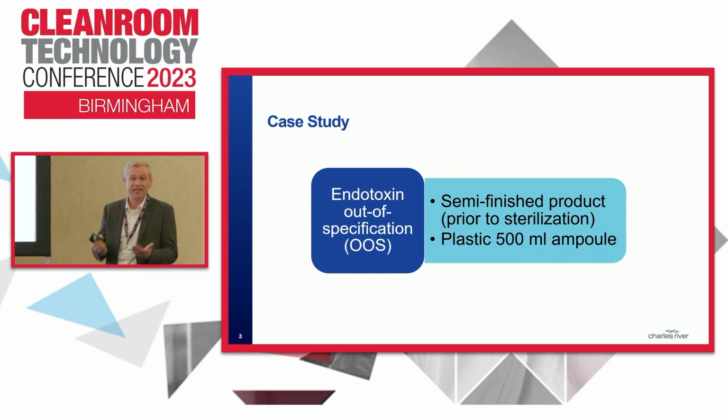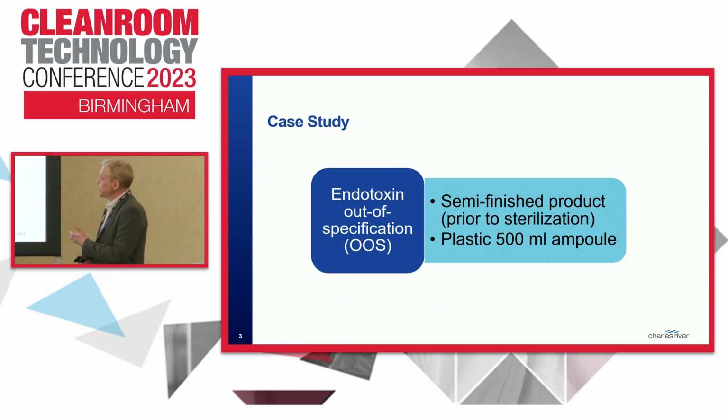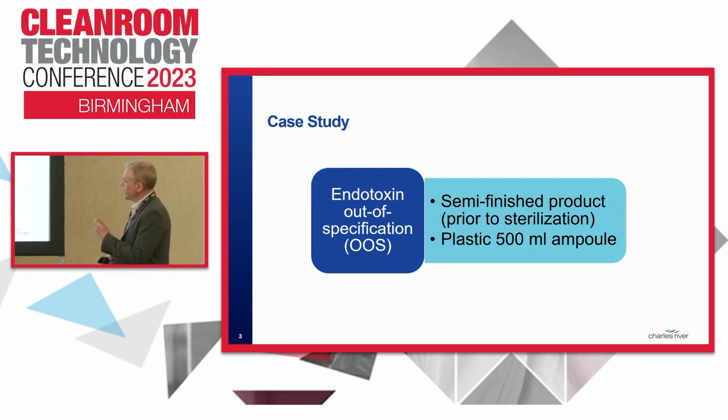If it remains in the product and ends up in the patient, it can cause serious harm to the patient. So when an event such as this occurs, obviously it has to be investigated. And when investigating an out-of-spec for endotoxin, typically the culprit you're looking for is a gram-negative bacteria, because that's where endotoxin comes from.